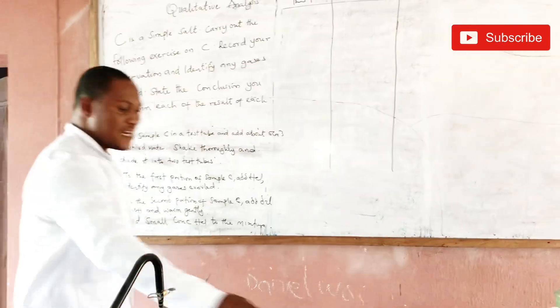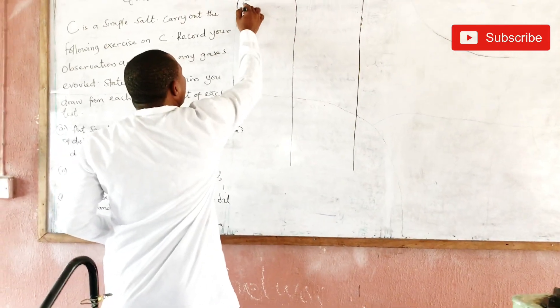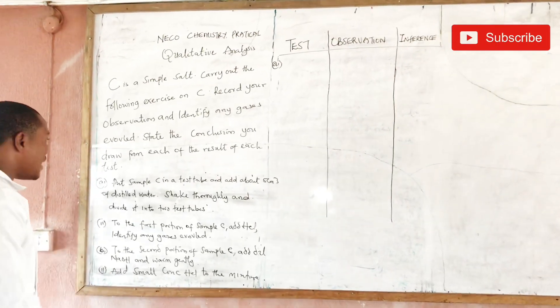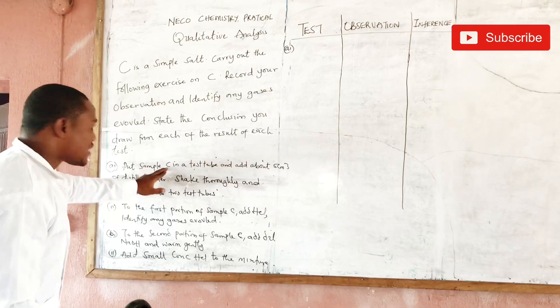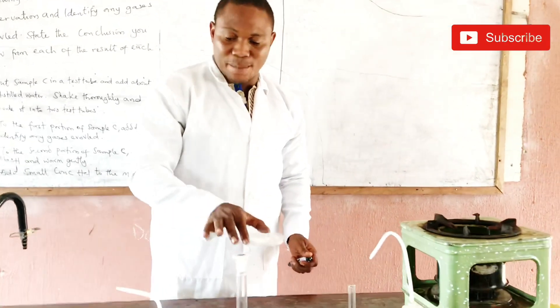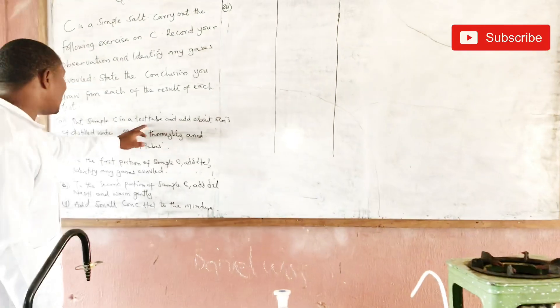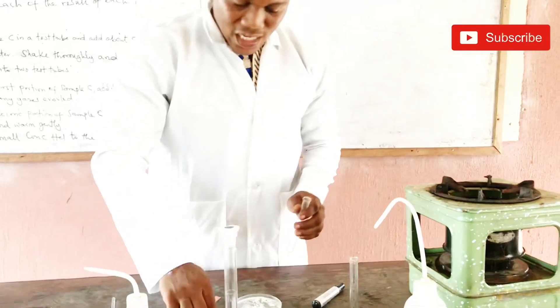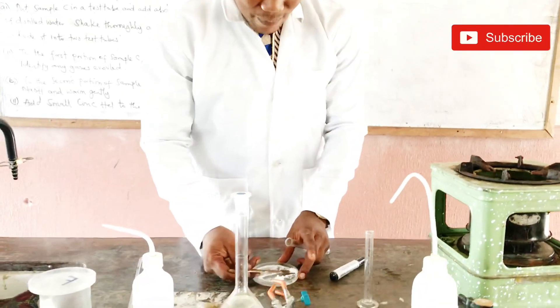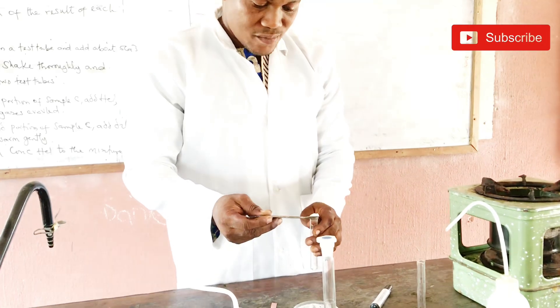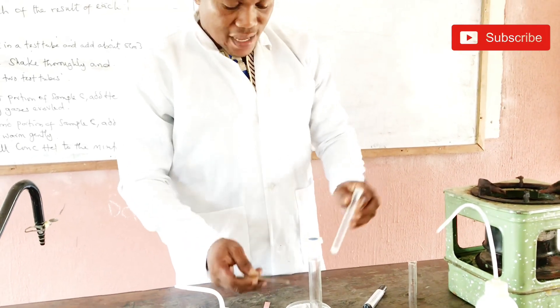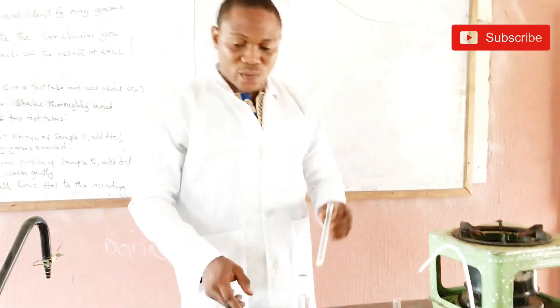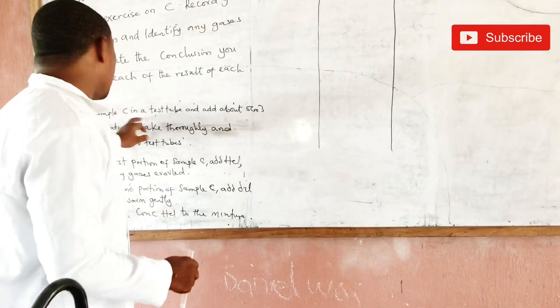The first one is part (a). Very important — number it the way they have numbered it in the question. Put sample C in a test tube. This will be labelled sample C. So the instruction says: put sample C in a test tube and add about five centimetres cubed of distilled water. With the end of my spatula, I'll take my sample C and put it into my test tube.